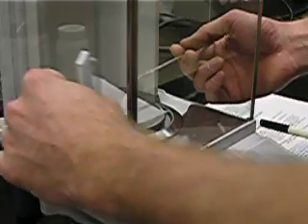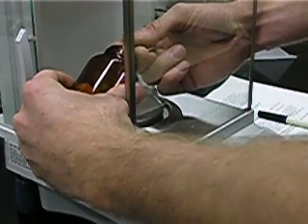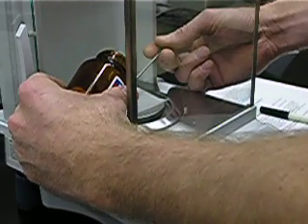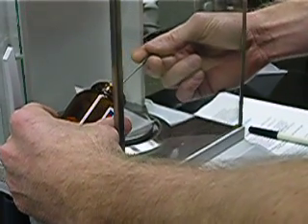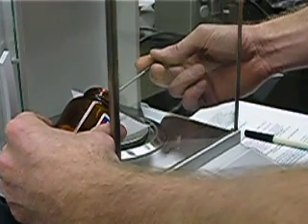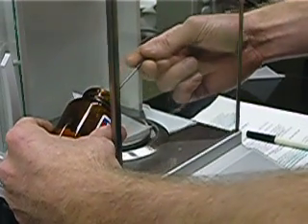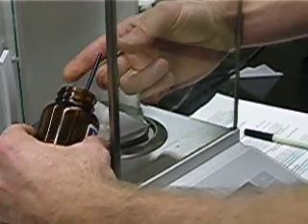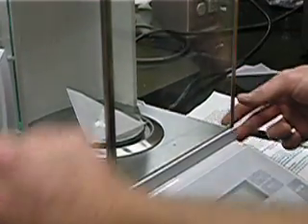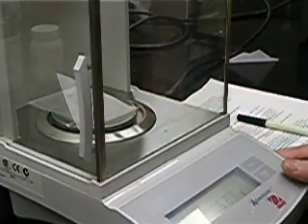I reopen the side shield, add more solid, watching the weight to see if I am close to 0.05 grams. I'm going to stop now — I've reached that weight, and I'm actually a little over 0.05. It's come to rest at 0.062.